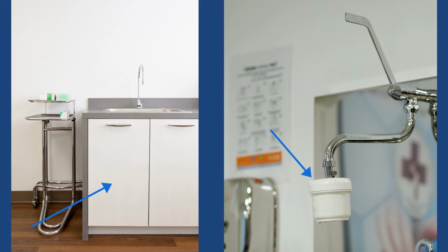If a fixture has a cabinet beneath it, like the example here on the left, take a photo of the piping below. If your fixture has any type of filter, like the example here on the right, leave them in place and again take a photo. Filter settings should not be changed prior to sampling so that the sample collected accurately represents what is consumed by staff and students. Save all photos as documentation. Photos will be important when results are being reviewed with an expert.